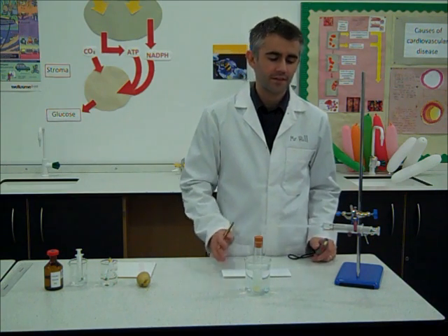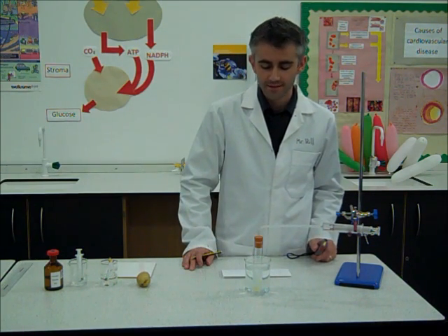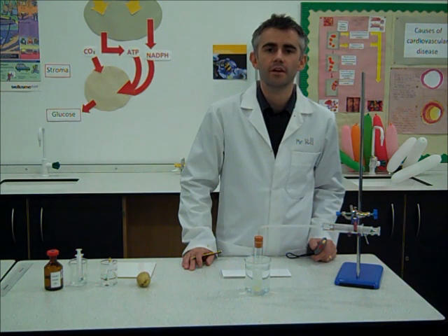That's been 2 minutes now. You can see that there's been quite a lot of oxygen produced there, which you'd expect because that's the highest concentration that we're going to be using of the catalase.